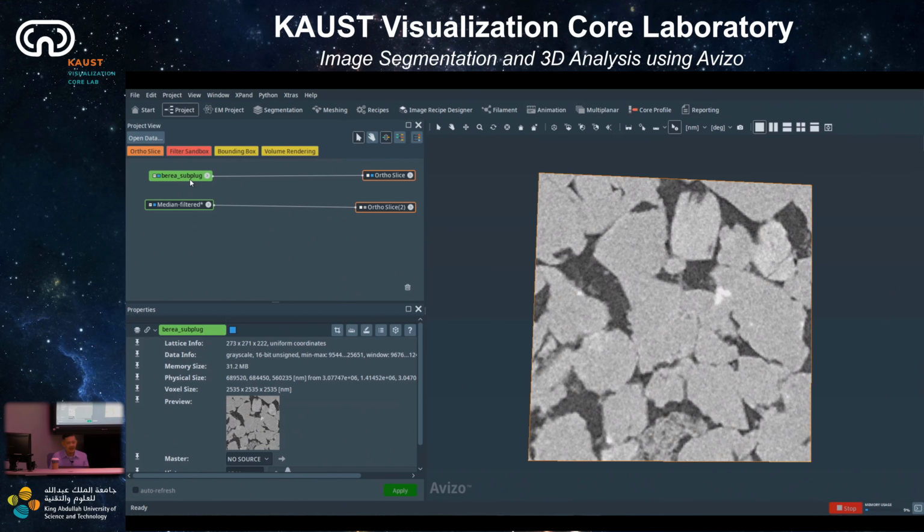Right click, and then let's say you can go to the compute folder. On the left, they have a folder of compute. And in compute, you can see that they have, sorry, I was a bit lost as well. No, it's not compute, sorry, it's the image processing folder.